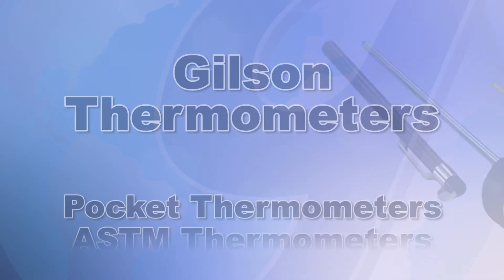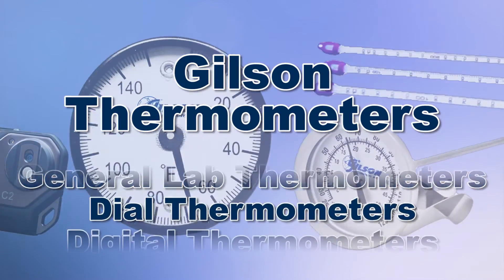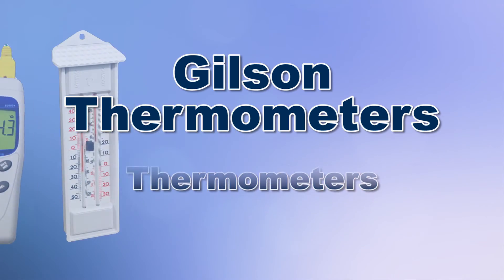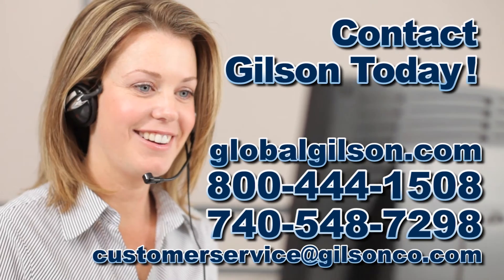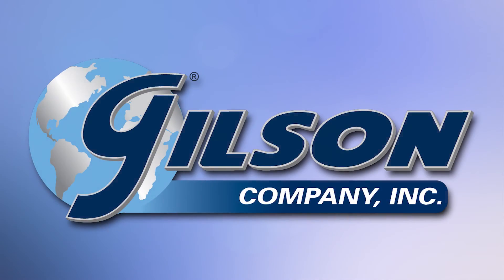With Gilson's complete family of temperature measuring equipment offering a wide range of performance, features, and capacities, Gilson has the right equipment for your accurate temperature determinations. Be sure to check out all our products listed in the Gilson catalog and on the Gilson website. Gilson — your industry leader in material testing equipment.